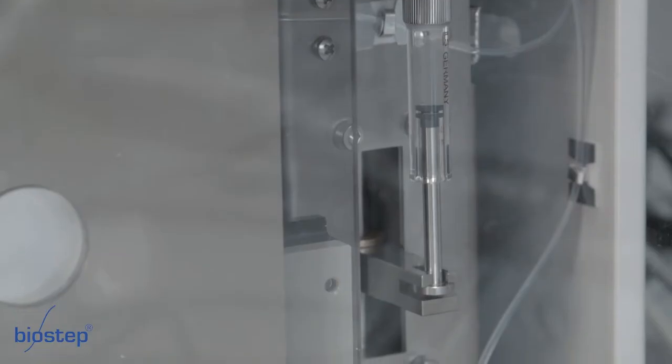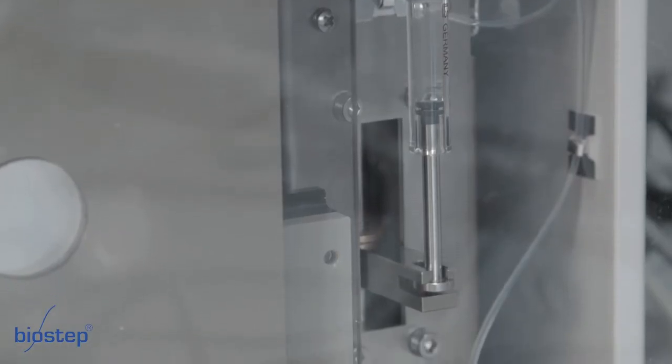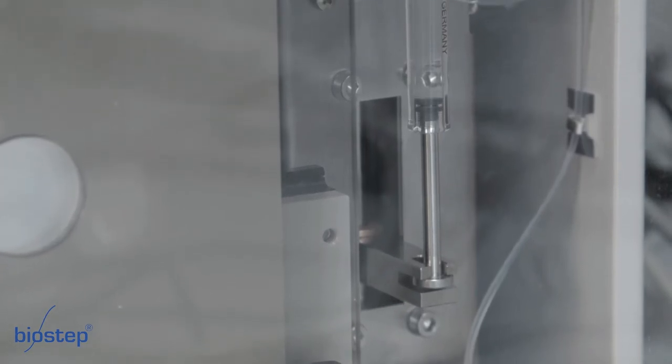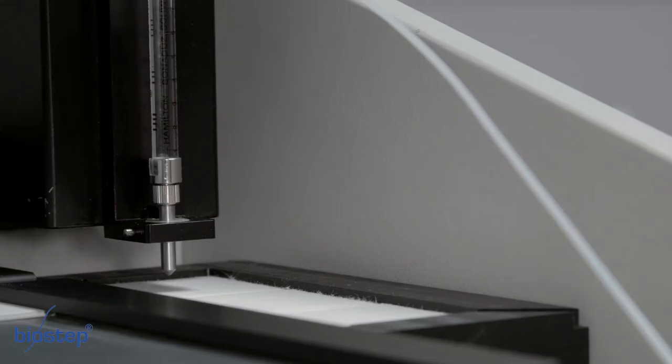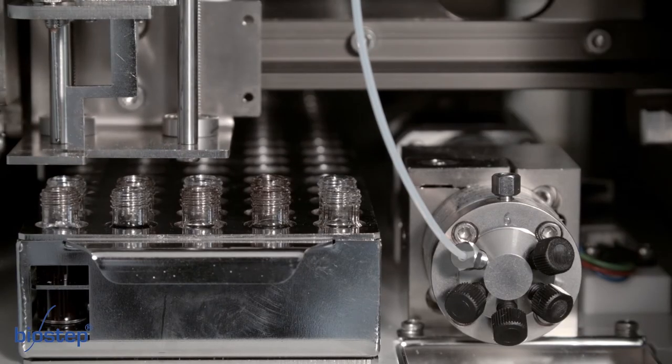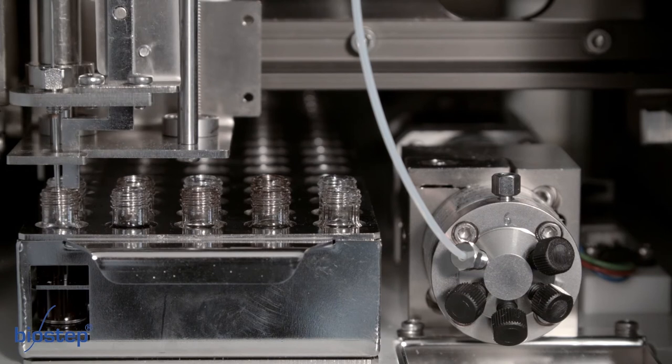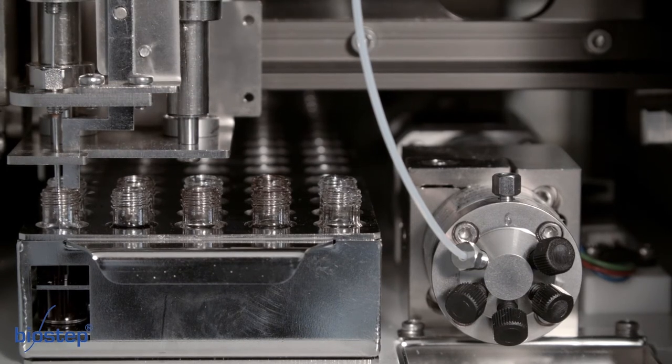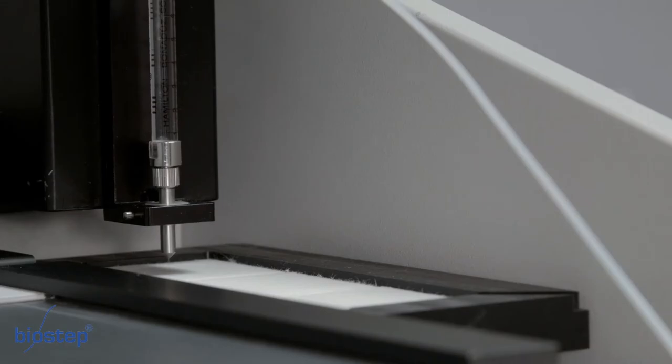First the system will be flushed. The suction syringe of the BS35 draws up the flushing solution. The flushing solution is ejected from the dosing syringe of the AS30 on the filter carton. The needle is positioned above the first vial and the first sample is drawn. The rest of the flushing solution is ejected out of the capillary and the dosing syringe. An air bubble separates flushing solution and sample.